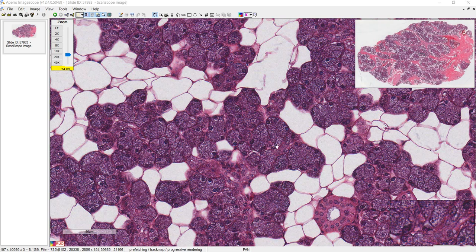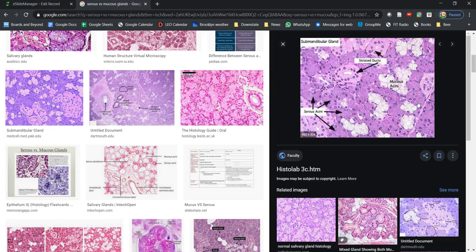All right, so this is the parotid gland, and out of the three salivary glands, the secretions for the parotid gland are going to be all serous. That's opposed to mucus, and you can tell the difference between serous and mucus because these are serous gland cells here, and it looks kind of bubbly, whereas in a mucus gland, the bubbles are going to look a lot larger. Okay.